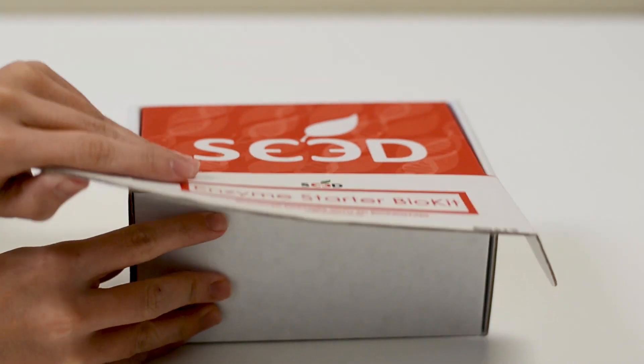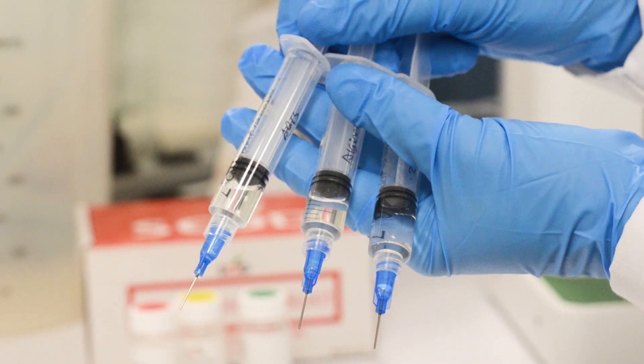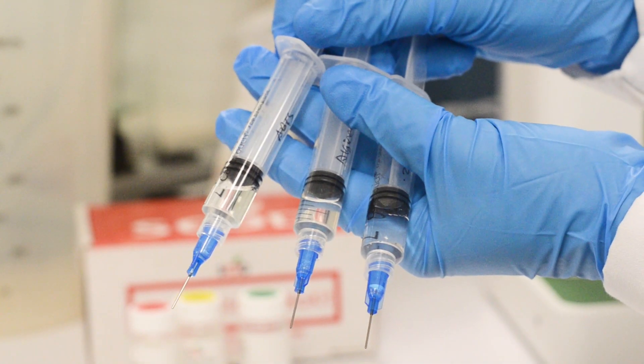Follow the instructions included in the Enzyme Starter BioKit to prepare these three syringes: the calcium chloride syringe, the alginate HRP syringe, and the ABTS hydrogen peroxide syringe.